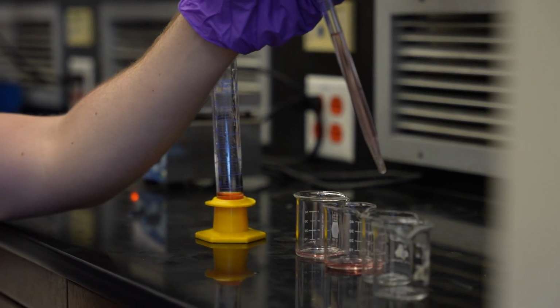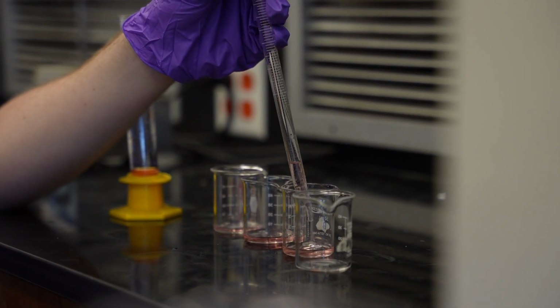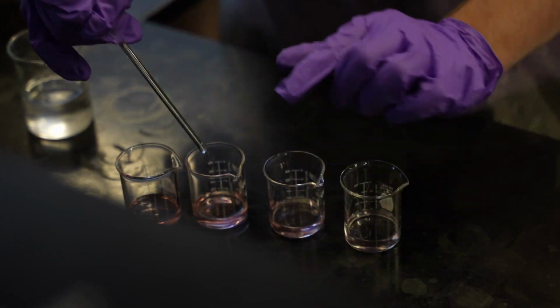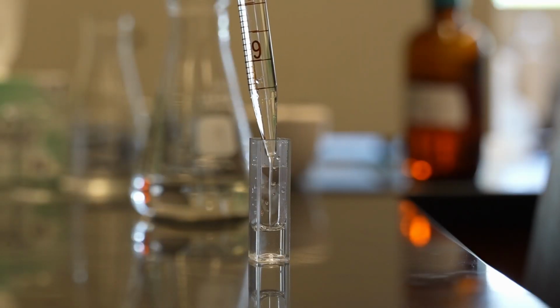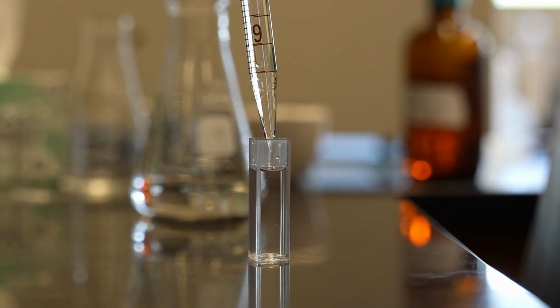Be very precise in your measurements. You'll also be using different pipettes to transfer dyes, so make sure to not cross-contaminate pipettes. Make sure to mix the solutions. Next, fill a cuvette up to the line under the arrow with the ethanol water mixture, and make sure to not over or underfill it.